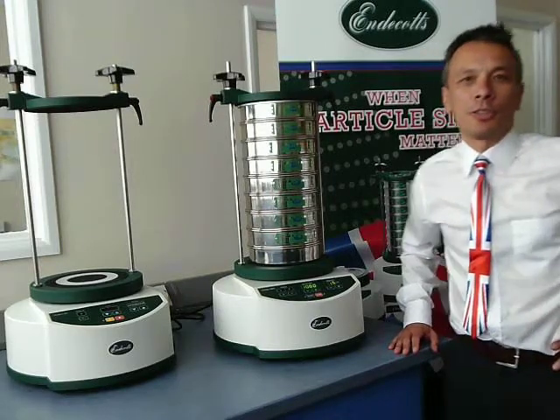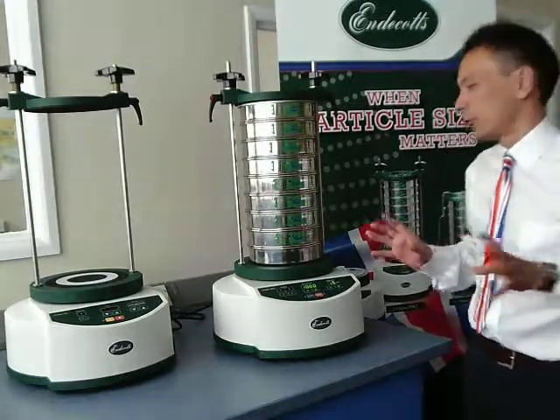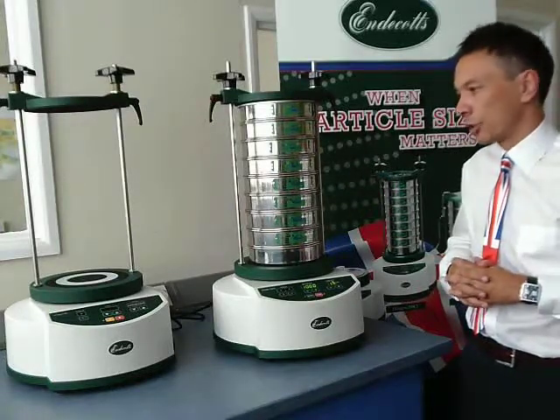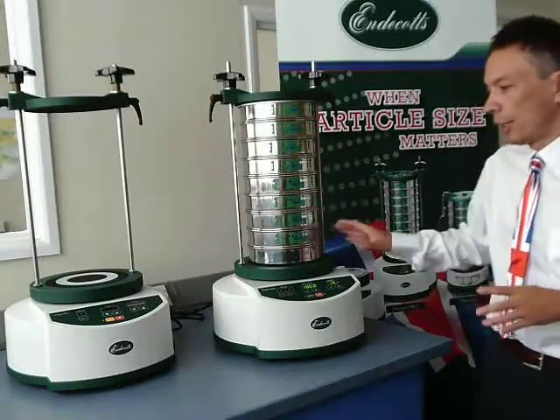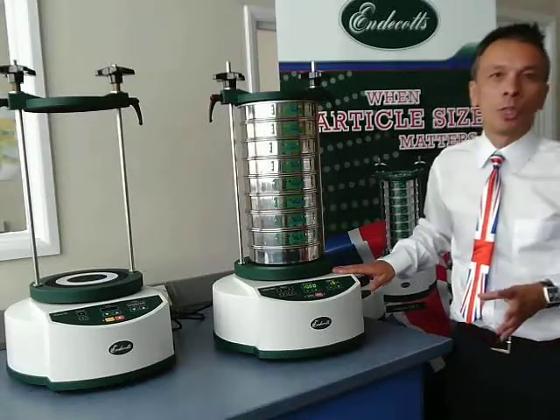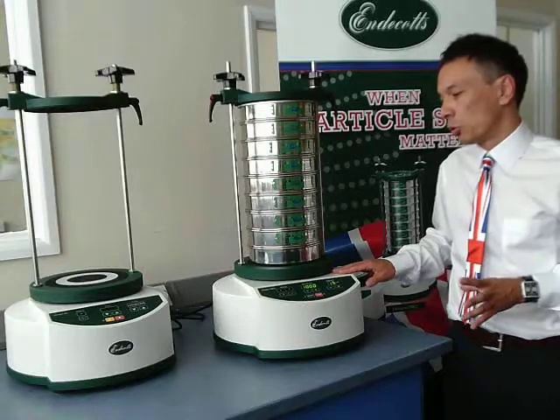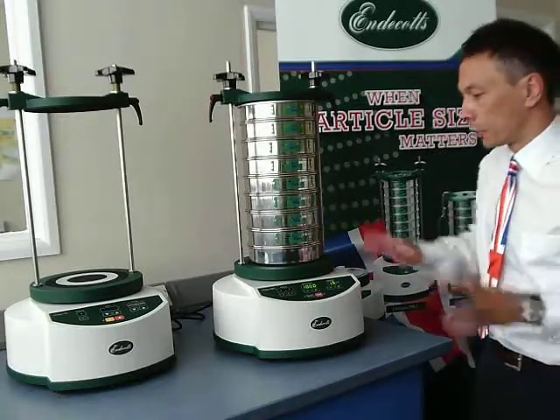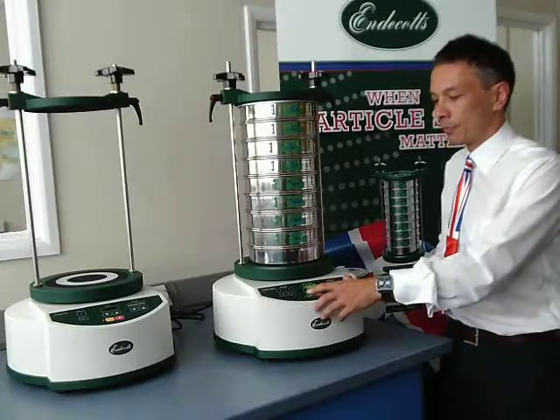Welcome to the new Endecotts sieve shaker range. I'm really happy to be able to show you the new features of our flagship sieve shakers. Here we have the Octagon 200CL. This is our top of the range sieve shaker for 200mm sieves and 8 inch sieves. I'll just press the button so you can see it in action.